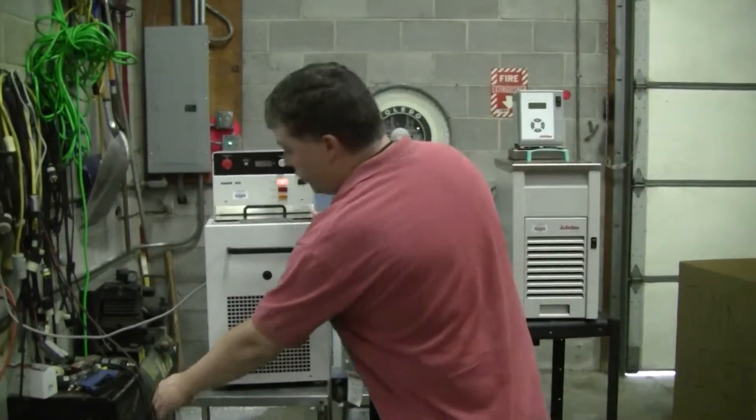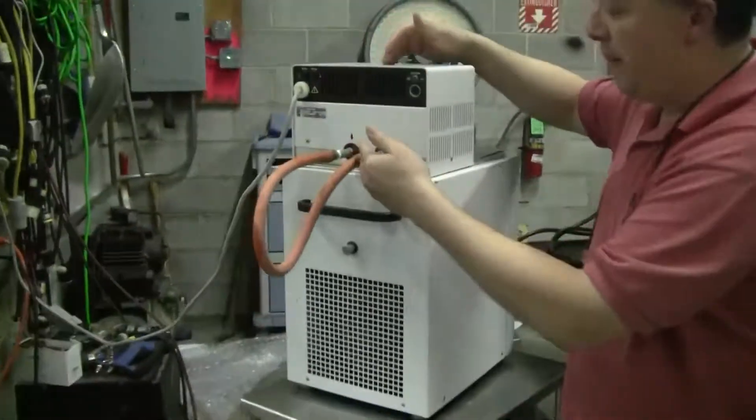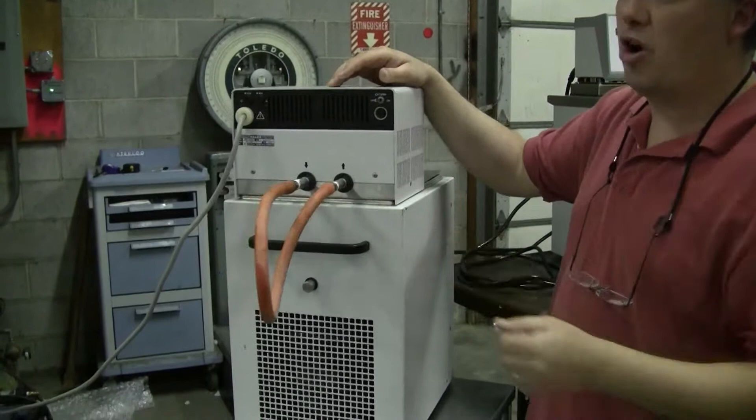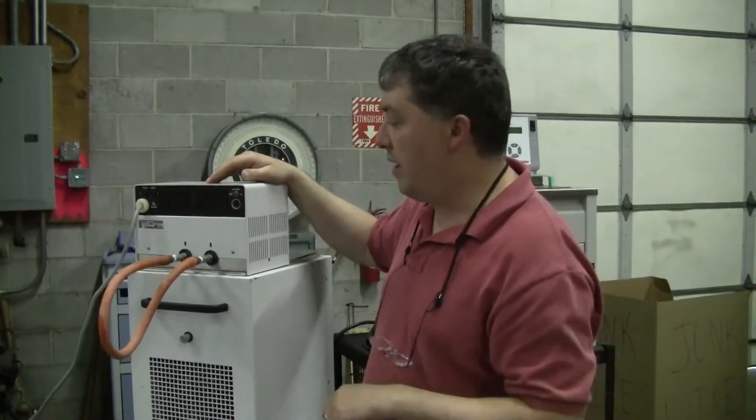Most recirculating chillers always have an in and out in the back. Tubing and the connections are not supplied — they're usually supplied by the end customer.